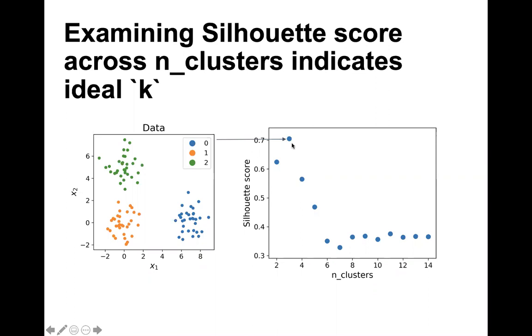This is not the only way that you can pick the number of clusters. There's a number of different techniques, but they all work in essentially this way. You formulate something, a desirable quality. I want to minimize this and maximize that, and just take the average difference between the two. And then you can evaluate the algorithm using different sets of parameters and say, for what set of parameters, K being the parameter here, do I maximize that objective criteria? And this gives you a way to pick K.